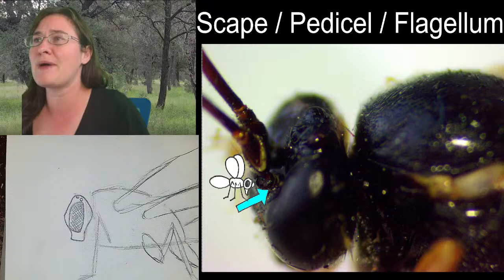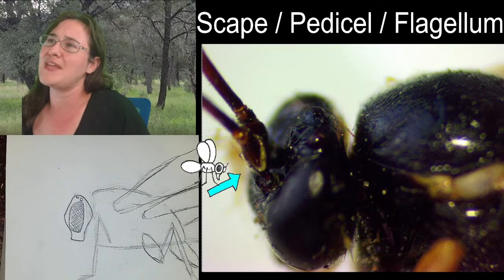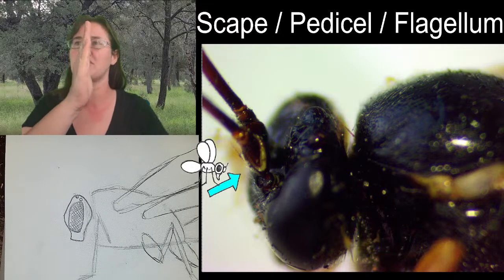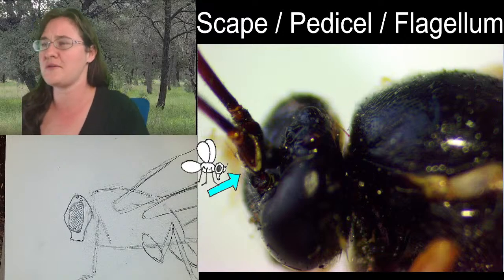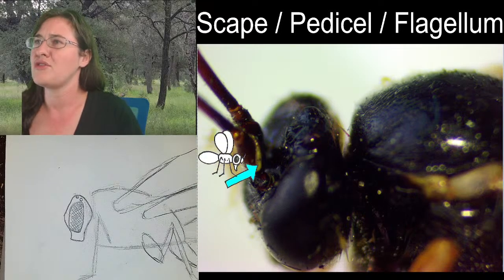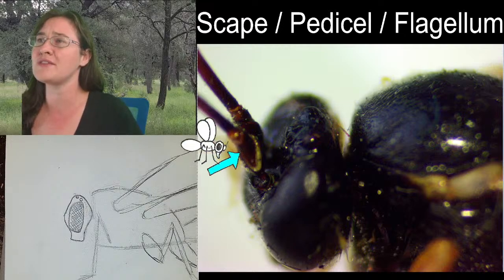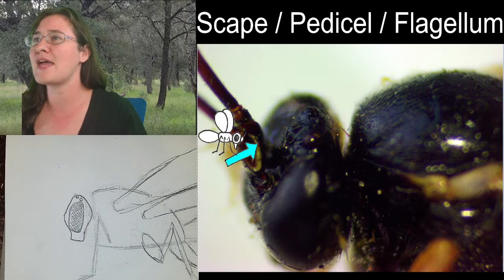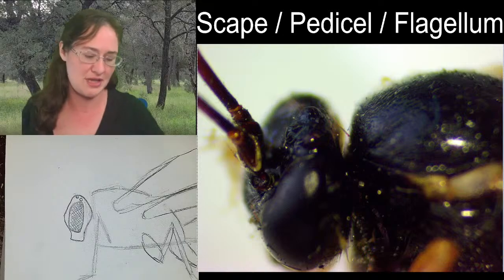Now, if we look right about here, this is our first segment of the antenna. It is the scape. It's coming out from the head, but it doesn't have a connection that's straight across. It's taller on the center of the body and shorter on the edge of the body, and then it connects at this diagonal. So where you see here, that U is the edge of the scape, because it connects tall in the center and then short on the edge, and both of them do this away from the center of the body. And then your pedicel comes out from that and comes to about here, and then your flagellum starts. And that's going to be the remainder of the segments.